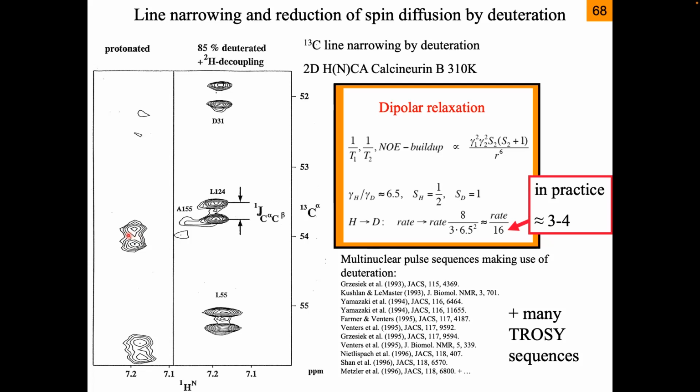This means your signal is modulated with a cosine that has a zero crossing at 1 divided by 2 times 30, means 1 divided by 60, is roughly 15 to 16 milliseconds.